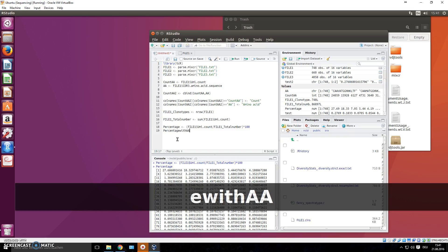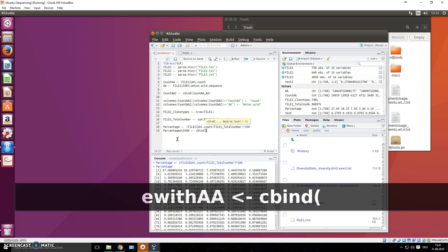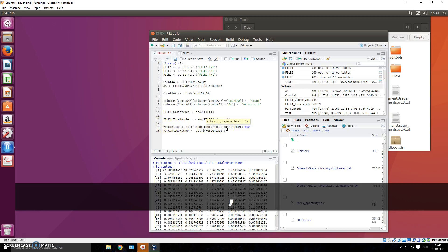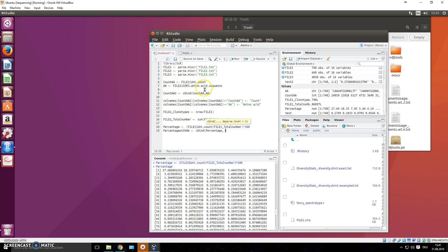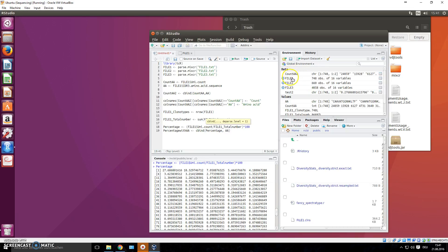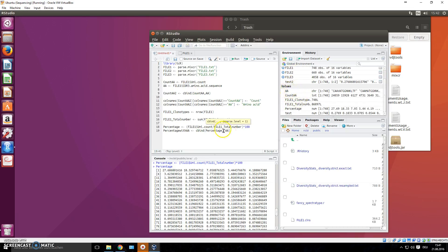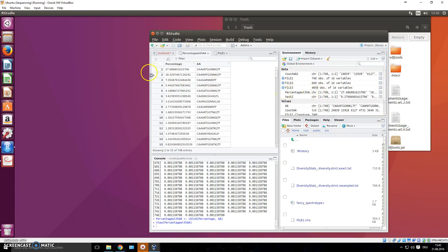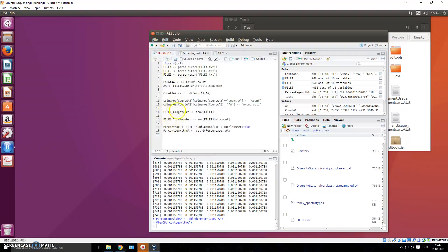Call it percentage_aa and assign cbind of the percentage object together with the aa object - which we already created earlier containing the CDR3 amino acid sequence column. Now we get a new object in our environment with percentage and amino acid sequence side by side, so we know this amino acid sequence makes up 27% of the whole repertoire.